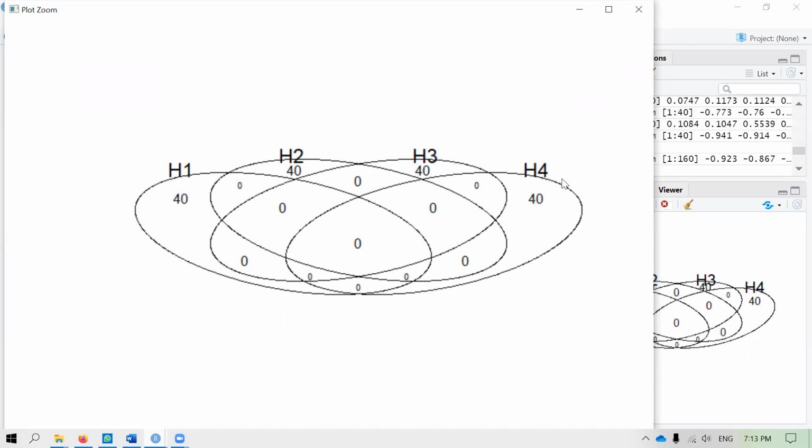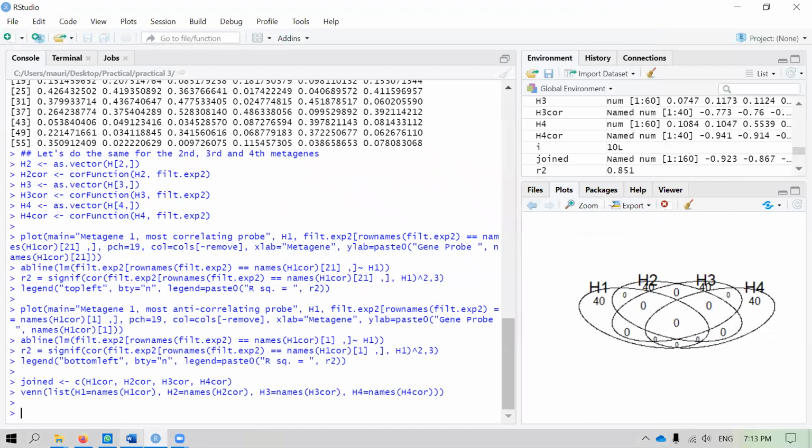Why not we look at these 160 probes and see what happens? Can we actually use this? So remember our microarray data, each clinical sample, each array has 1,500 probes, but we can actually narrow down to 160, which seems to be able to differentiate our cancer subtypes well enough. At least it seems to be the case. So let's take this further and see where we can go from here. Does it eventually break down? So let's continue.